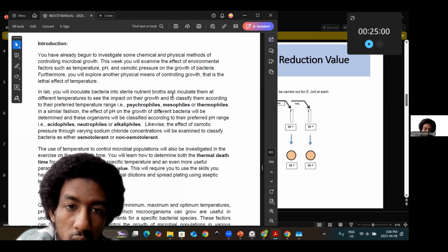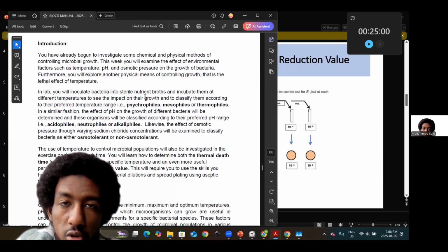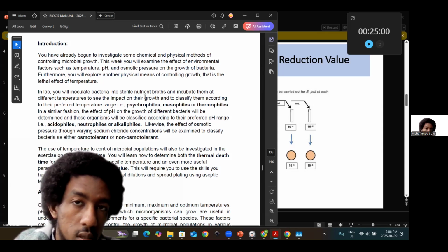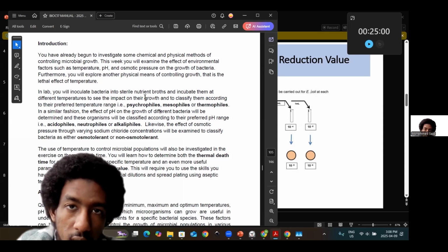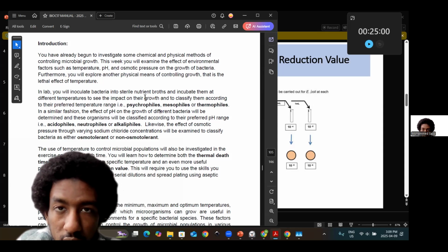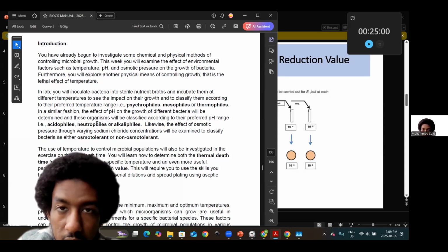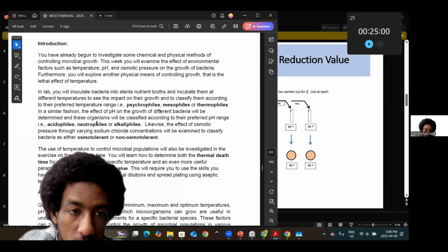And by the way, when we're referring to these different classifications, we're assuming that's where they most optimally grow, for specific bacterial species, not the genus. Because we saw Bacillus stearothermophilus versus B. subtilis, right? So there are differences, but bear in mind that the different classifications can be specified for the different optimal growth conditions.